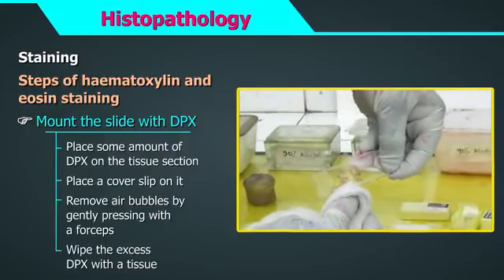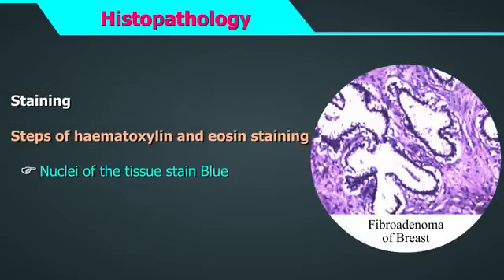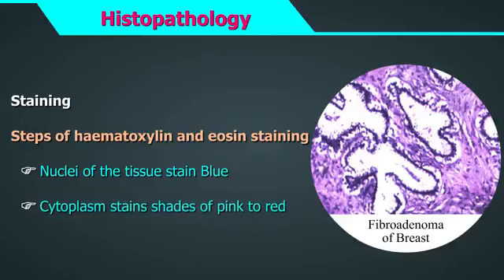The slide is now ready to be viewed under the microscope. The nuclei of the tissue stain blue, while the cytoplasm stains shades of pink to red.